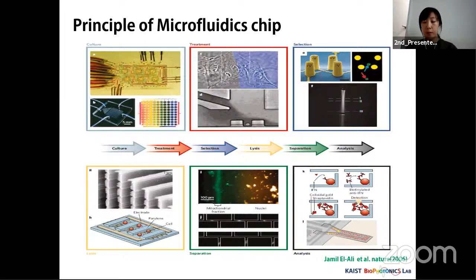Treatment is possible from sample collection and culture and pre-treatment. It is also possible to select a desired sample to react and separate it. Therefore, it is possible to detect the desired material using the sample. Its analysis time is usually very short, and the technology can be applied to all fields requiring chemical analysis.